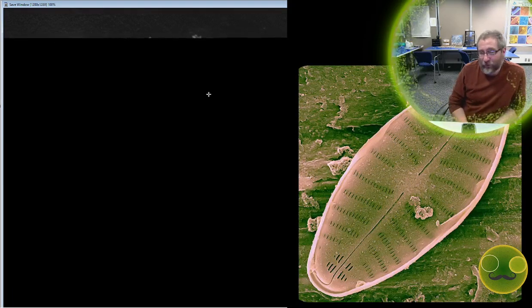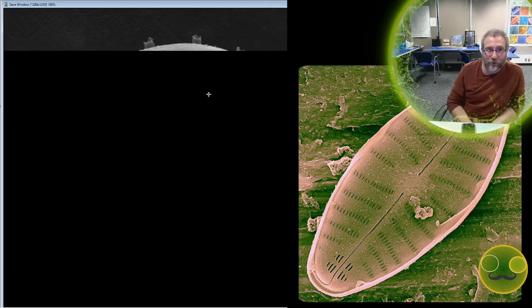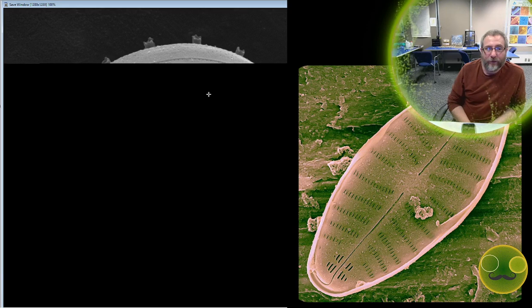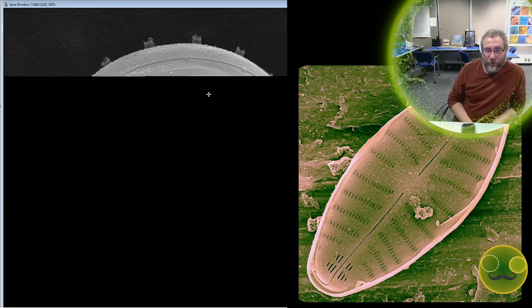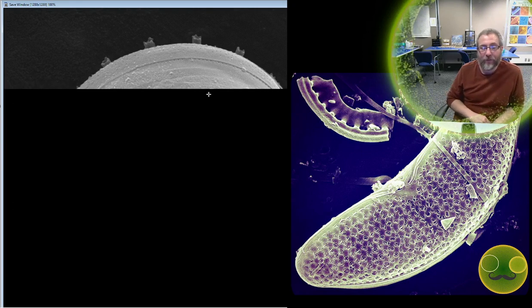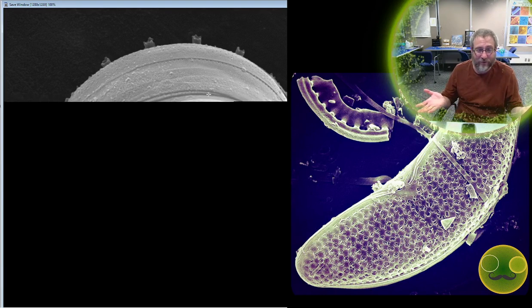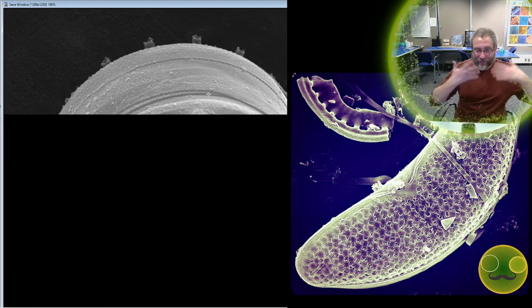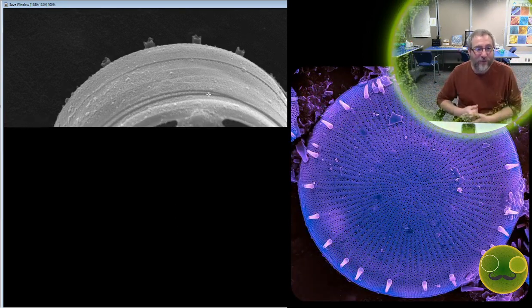normally I look at stuff in the light microscope. Most scientists who study diatoms look at them in the light microscope. They're too small to see for the most part. Almost all of them are too small to see in hand sample, but you can see them in the light microscope well enough. But the problem is that most light microscopes powerful enough to actually see the diatoms are transmitted light microscopes, and it's basically like an X-ray, right? Imagine you only saw human beings as their skeletons. You can't see their facial features, you can't see any of the things on the surface of their skin. You could only see their bones by looking through them.